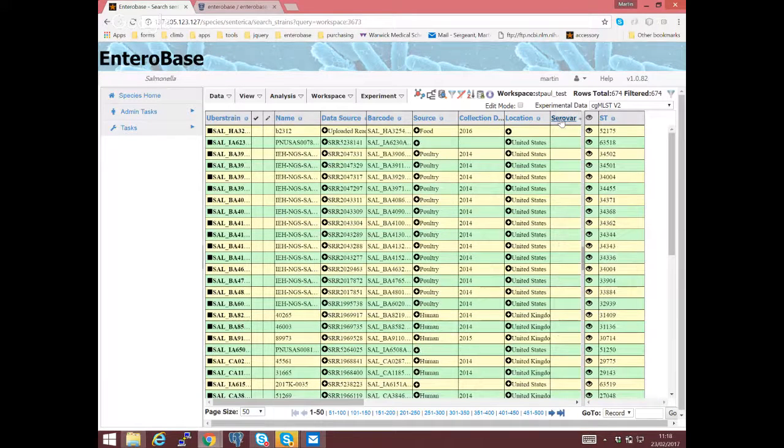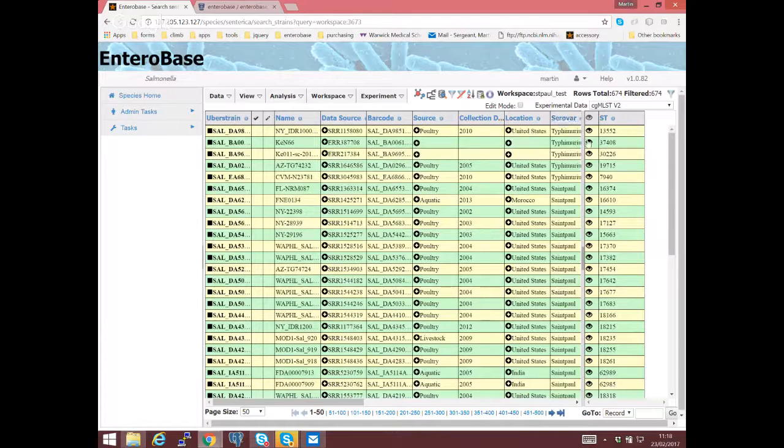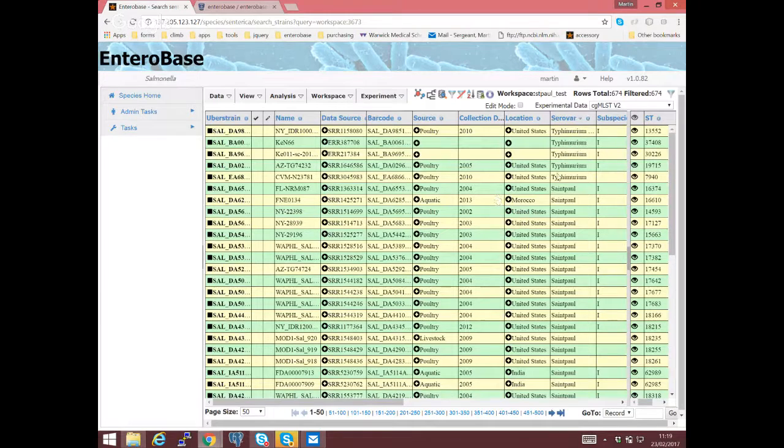Again, we're going to sort. So you can see here we've got some mistakes. These should be St. Paul, and we want to change them. So we have to go into edit mode.